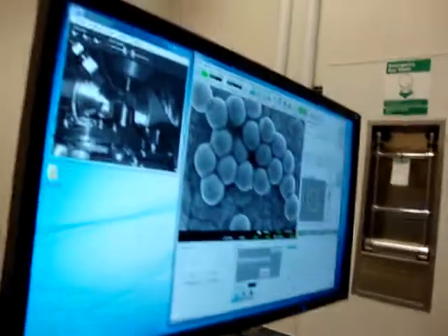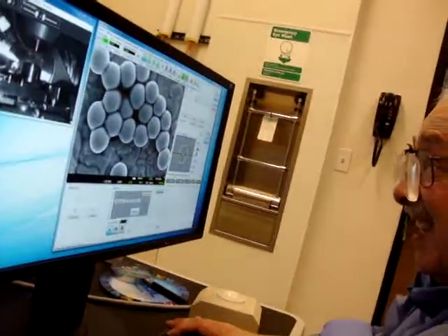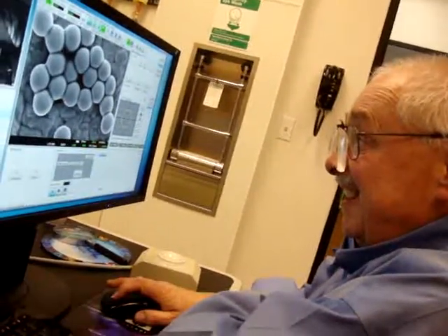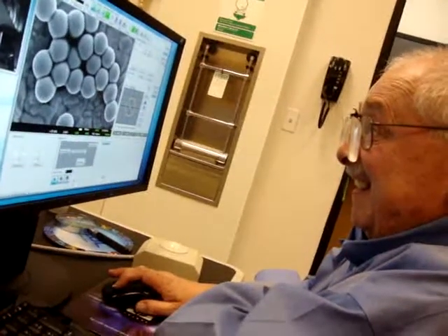We're not at 15 kV, which you get your maximum resolution. So higher the kV, more resolution, up to 15. Okay, yeah. Lower the spot size, higher the resolution. Yeah. And what else did you say? Oh no, that's it.